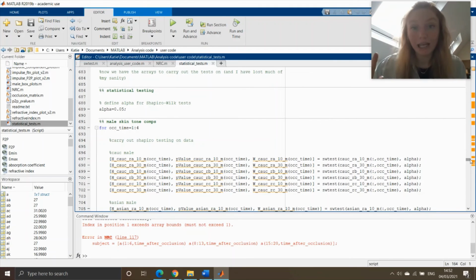So disclaimer, this is using 3 different types of tests. You're doing Shapiro-Wilk, one-way ANOVA, and Tukey-Kramer. These are all statistical tests that you can carry out. Your Shapiro-Wilk test is telling you whether you can assume that this data is normally distributed, because that assumption is used by ANOVA 1 or one-way ANOVA and Tukey-Kramer tests that you're going to use next.